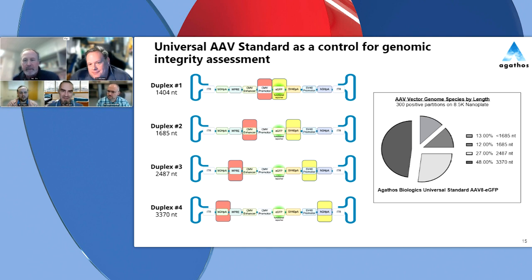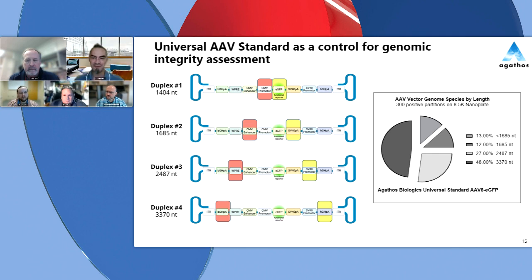Yeah, well, I can add some additional information, of course. I must tell you that when we first ran these integrity assays on AAVs, we were very surprised because the values that we were getting in terms of numbers of complete genomes were very low. They were from 20 to 40% of, let's say, whole populations of different genome fragments.